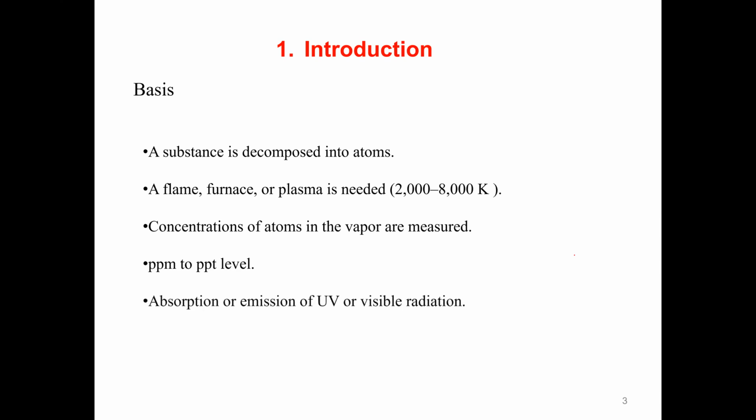Because those methods are related to transition of electronic state, there will be no chemical bond because no molecules. Therefore, there will be no vibration state transition. No chemical bond, no vibration, right? That's why we got separated line spectra. These spectra are related to electronic states of the outermost layer rather than the inner layer. That's why we got the spectrum in the UV, ultraviolet, and visible range.